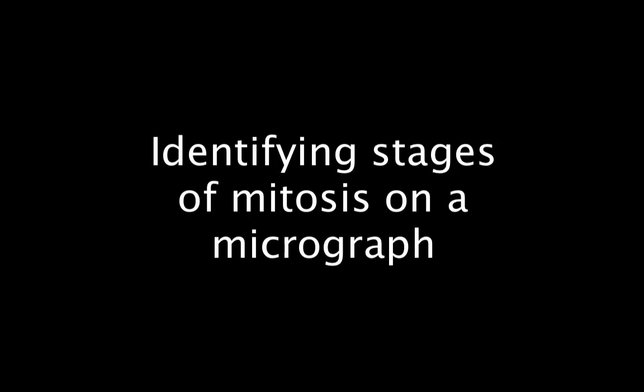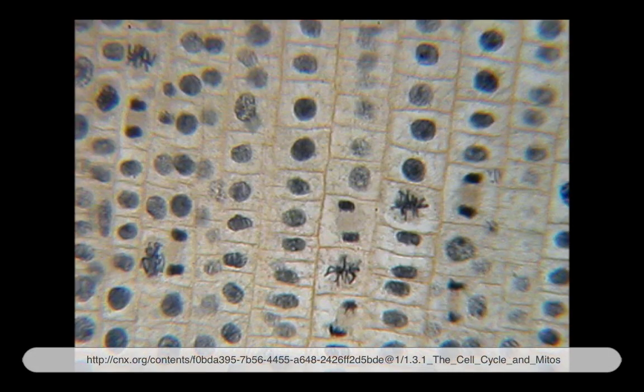Now let's take a look at the stages of mitosis as seen on a micrograph. In this micrograph, we can see some cells that are actively dividing and some that are not. So of those that are actively dividing, let's identify which stage of mitosis they are in.